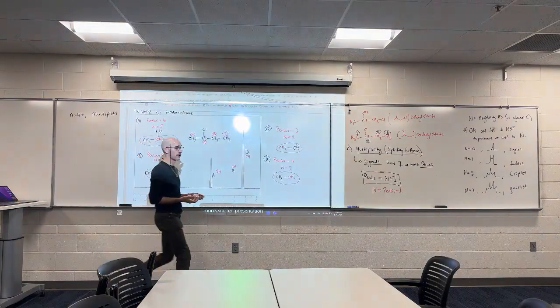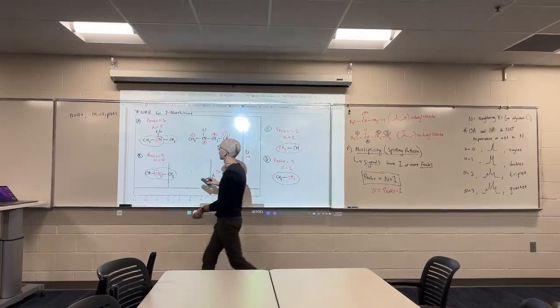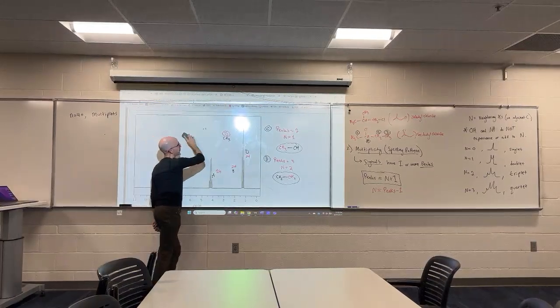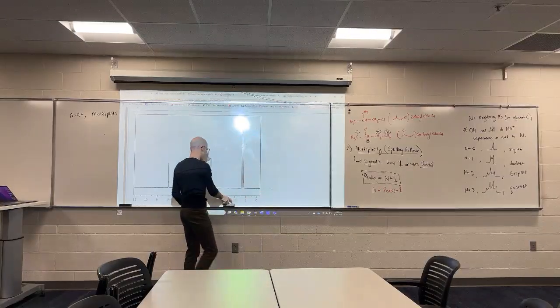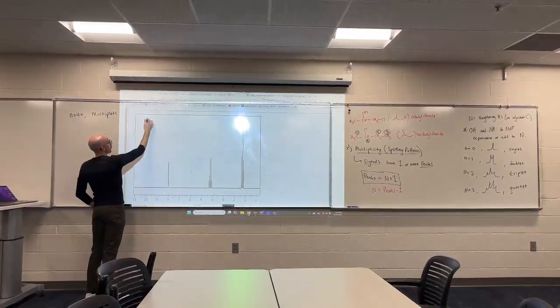I want you guys to spend the rest of today trying to solve for this structure. And when you've solved it, you're free to go. In the last couple of minutes of class, if you haven't solved it, I'll walk through how to solve it.